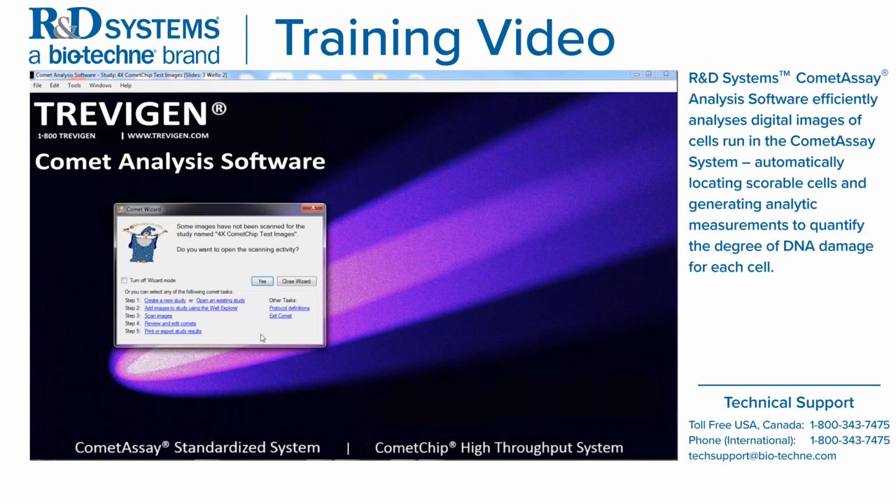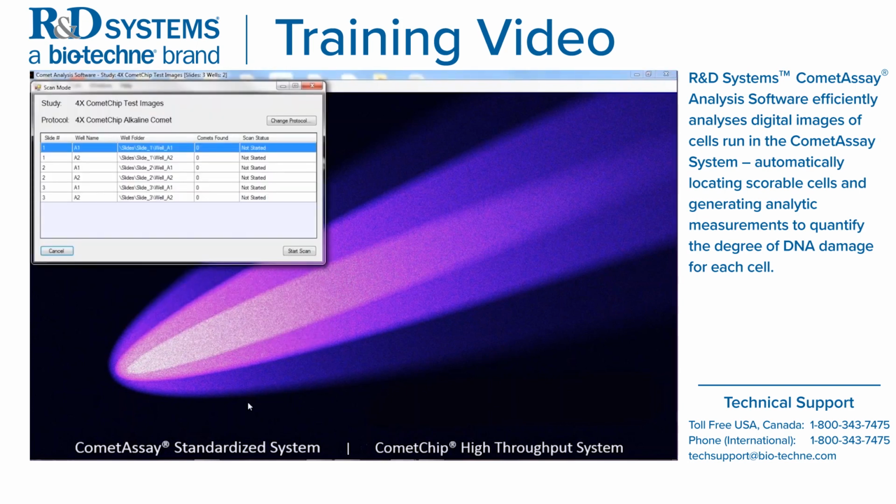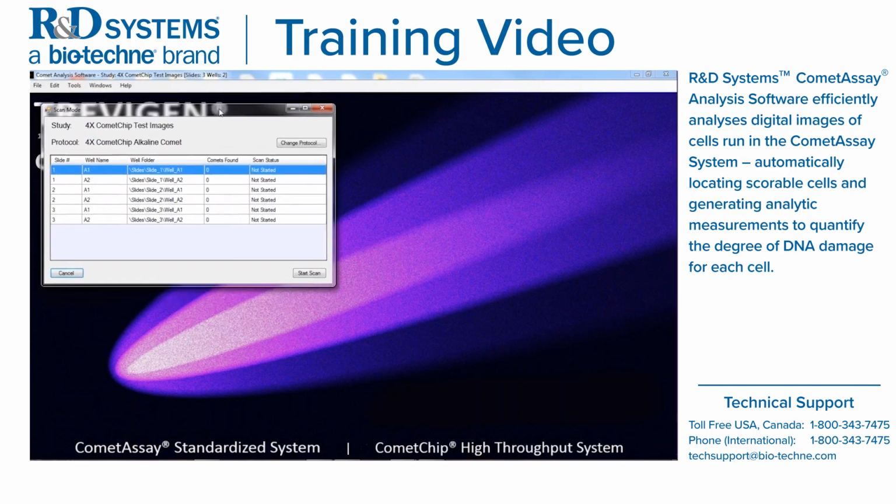So the third step is the wizard now is asking, do you want to open the scanning activity? So this is the third Comet task. So you see step 1, you can always move between steps, but we created the study. Step 2, we added the images using the Well Explorer. And now the third step is, do you want to scan the images? So let's select yes. And now a new window pops up. This is called Scan Mode.